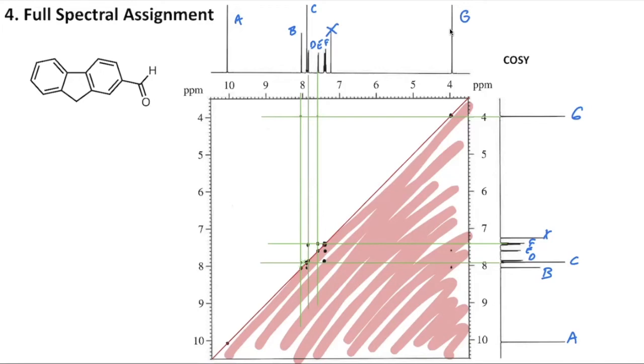Okay, so now that we've got things where we think they should be, let's go ahead and label all of these cross peaks to see what they tell us. So I'm just going to start near the top. You start wherever you like.